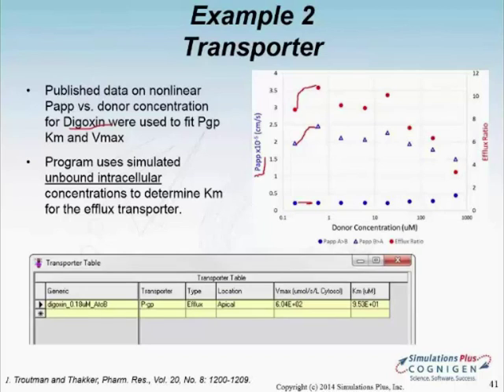Another question just came in. Might have to ask for some clarification, but can we use this for silver nanoparticles? No, not really. The focus was mainly looking at what would be happening to the small molecules, to the APIs.